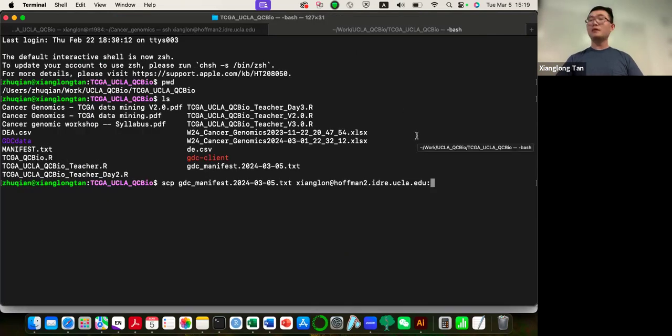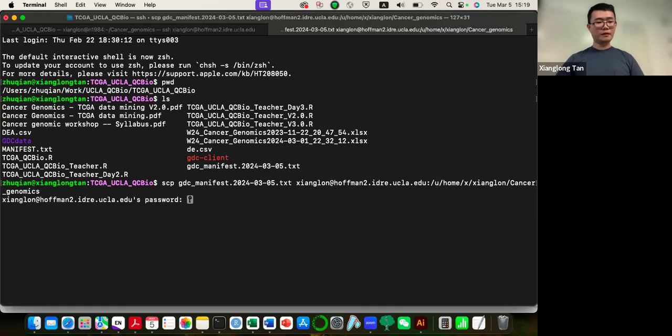So we just upload this text file, the manifest, in the same folder where we have the GDC client. Yes, yes, yeah. Okay.